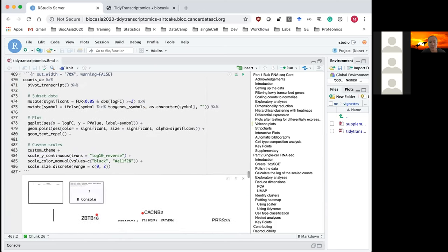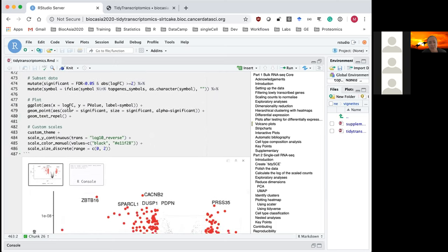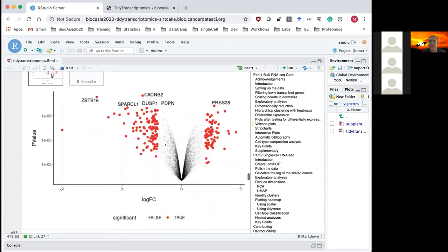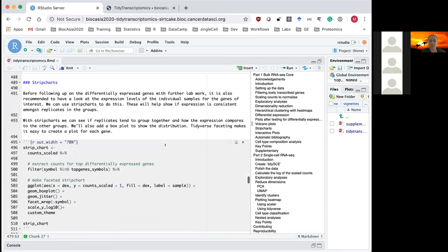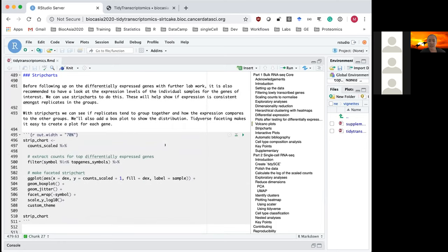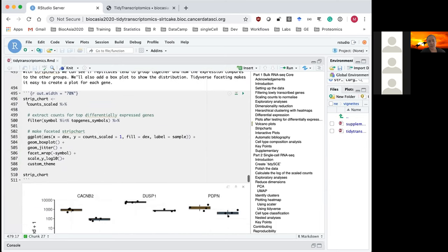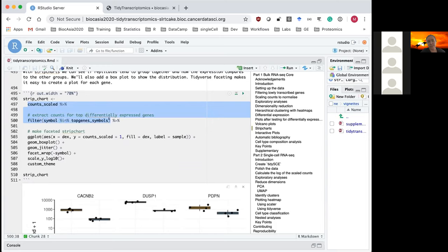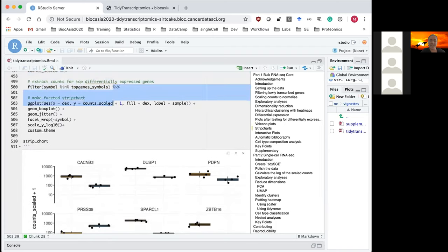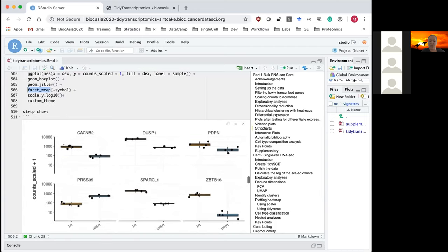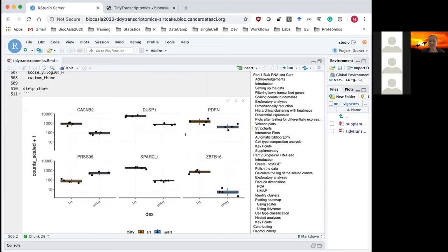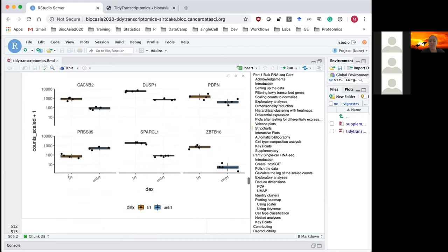We can further customize the plot using ggplot's color, size, and alpha aesthetics. Another common plot is looking at individual counts for top genes using strip charts. We use tidyverse filter to select the counts for our top genes, then pipe into ggplot to make jittered plots and box plots, taking advantage of facet_wrap to quickly create multiple plots — one for each of the six top genes, showing individual count values in all samples for both treated and untreated groups.